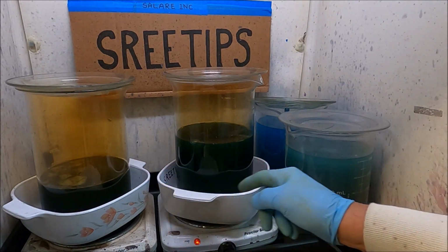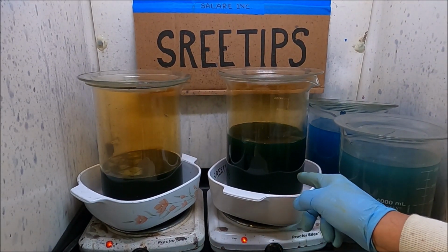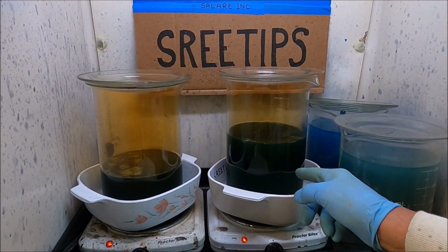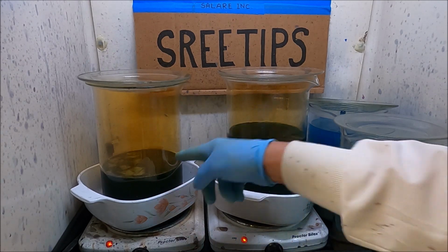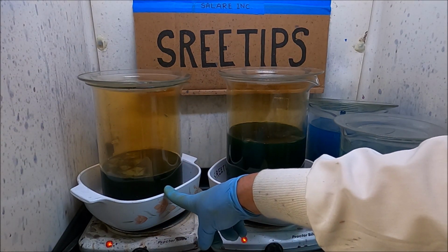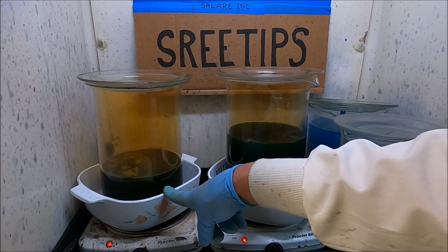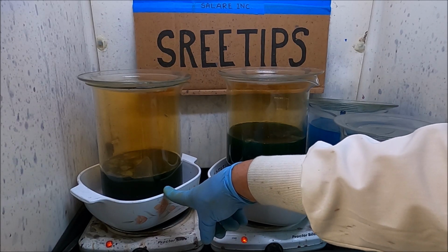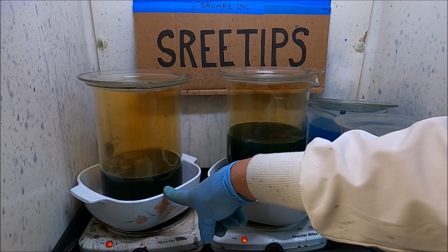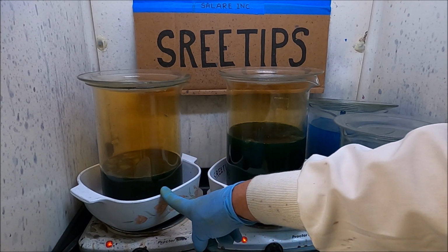These two beakers will have the solids that we got out of the slimes. This is going to have the big chunks of silver in it. This one had the finely divided material that we poured through the nylon strainer in our attempt to rinse off the silver granules and reuse them. That didn't work. And so this is going to have the finely divided material in it.